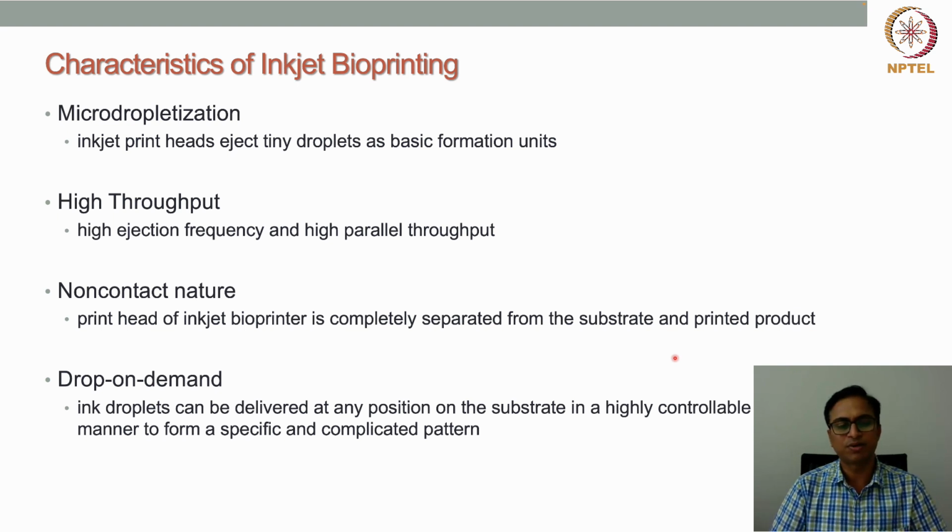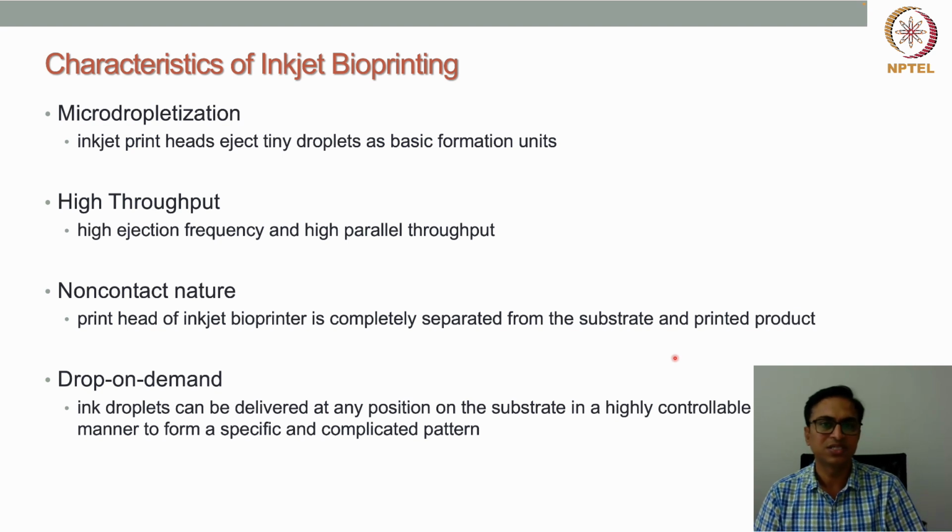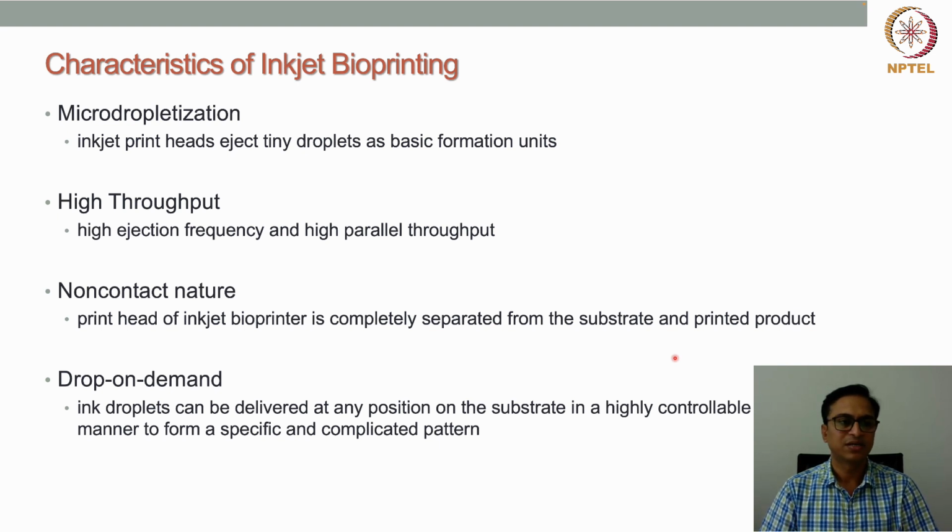The other thing is drop on demand. As we have seen, whenever a droplet is required, only at that time the drops are generated. So drop on demand is a very important characteristic of this bioprinting technology.